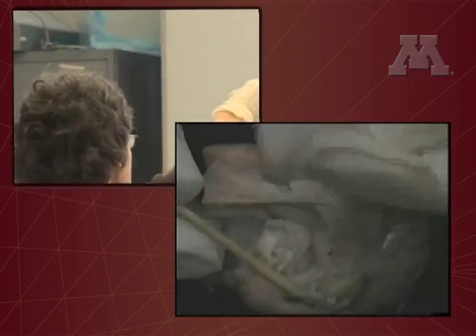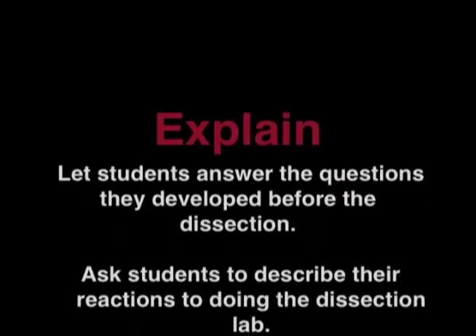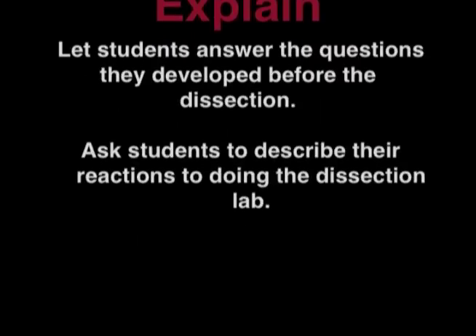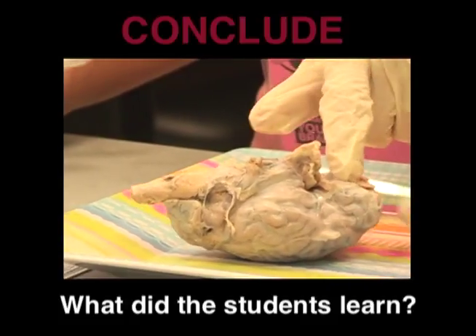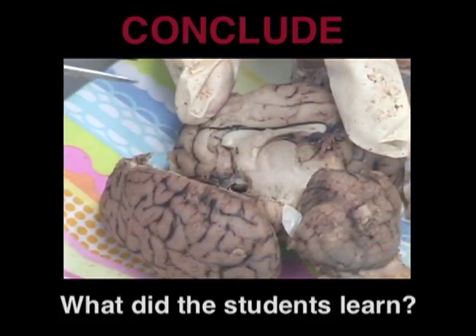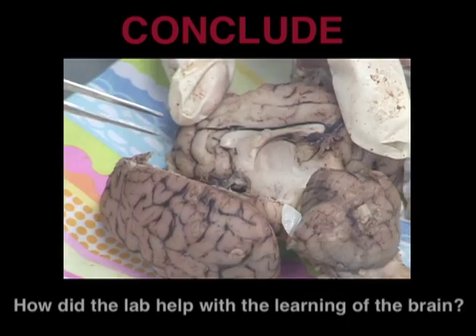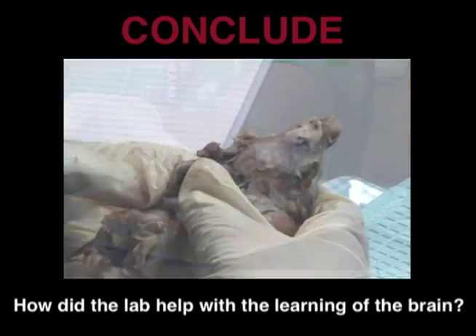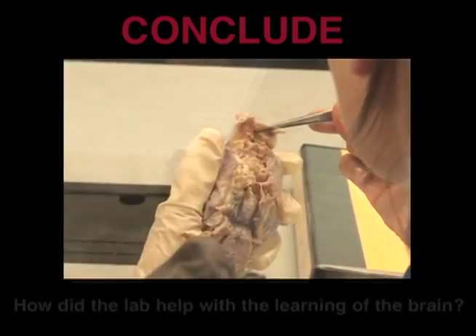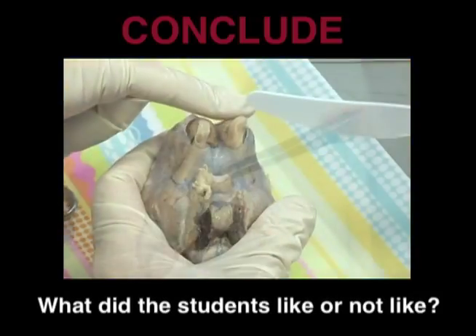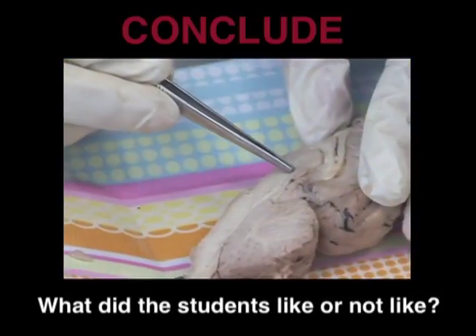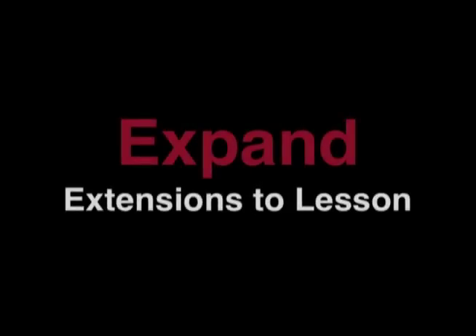You should all go looking for the hippocampus because that's a really important structure. You can see the hippocampus clearly when you look in there.